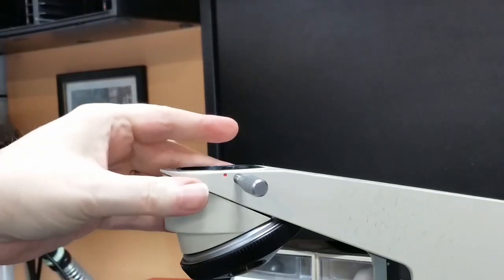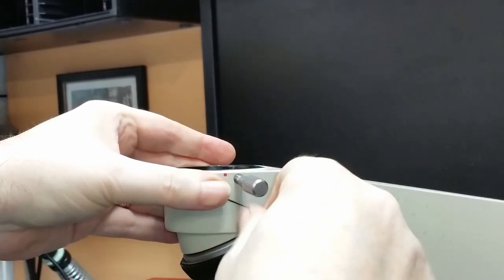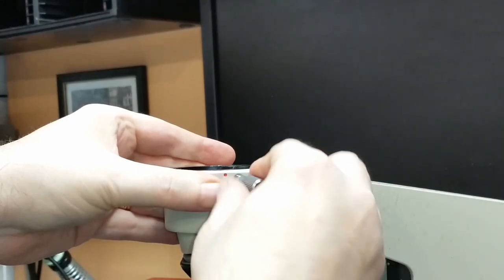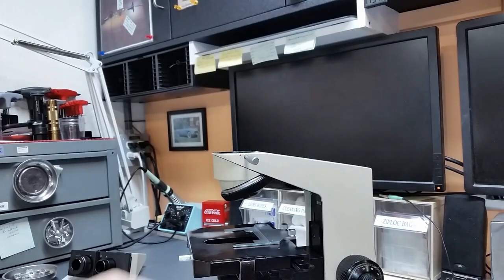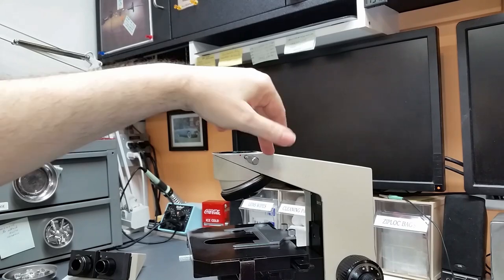If you had a BHT or a BHS, what you would do is loosen it until it wouldn't loosen anymore, then actually pull this thumb screw out — it's spring loaded — and remove the head. But other than that, it's the same. So what I'm going to do now is set this stand aside for safe keeping, and we'll get started on the head.